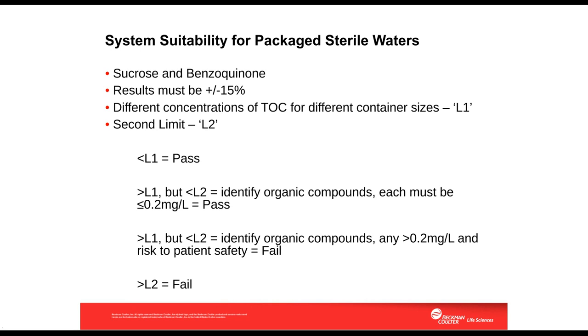Now, this section here, the system suitability testing for packaged sterile water, this is where the substantive changes to USP 643 have occurred. In addition to passing the system suitability test with the same plus or minus 15% limit, it now allows for different concentrations of TOC depending on the container size for the packaged water. And this is called L1. And as long as the water sample being tested contains less TOC than L1, it is deemed to have passed the test and the test is complete.